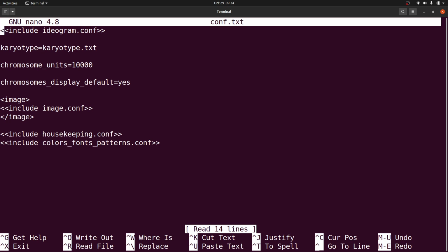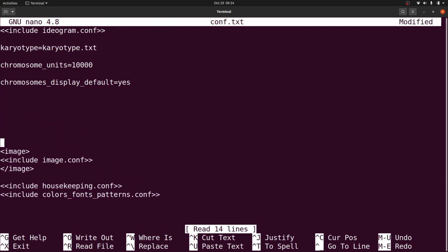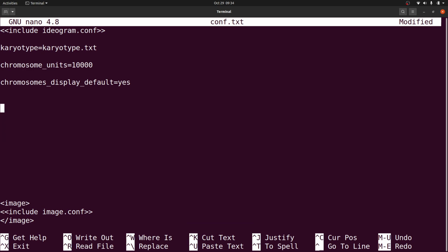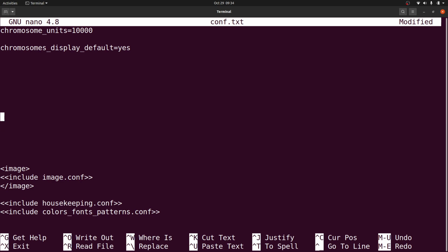Okay, so I'll come here. These are all okay, so I'll put the next commands within this region. I don't want to risk modifying them, so I'll put them somewhere here, and then I'll modify this one here. So I'm going to add the plot.